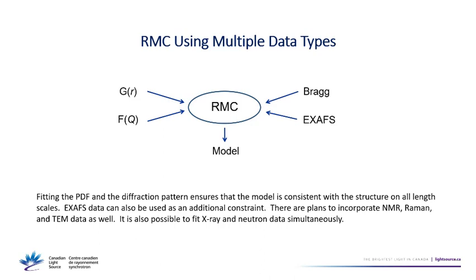If it's crystalline, you can also do Bragg peaks and have those in there, so you're basically doing a Rietveld-like refinement. When you have mostly crystalline materials, that can be useful because it adds back in some three-dimensional information, because you've indexed the peaks. So they have an HKL with a relative direction to each other. And you can also add in other types of data like XAFS, which adds a further constraint specific to a few elements, but it further restricts it.